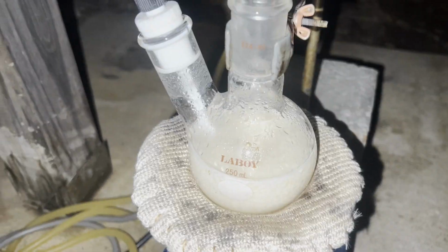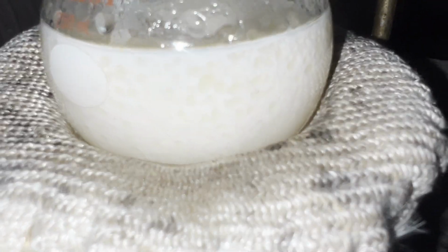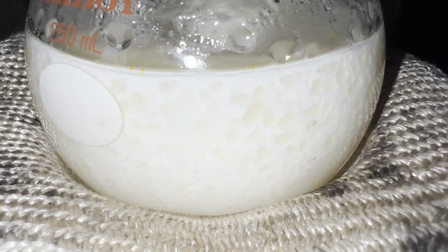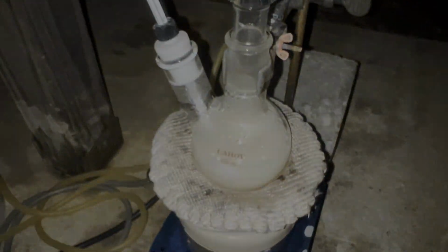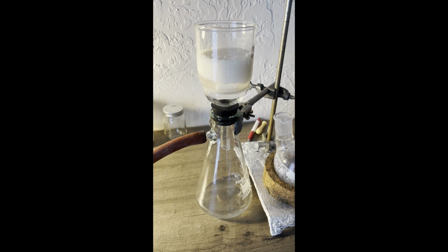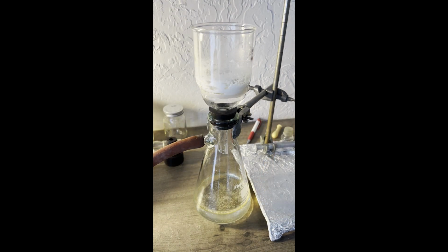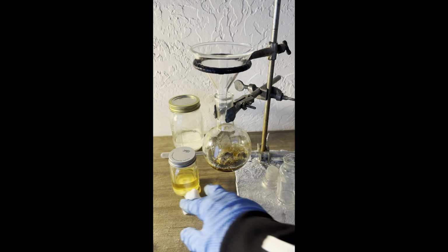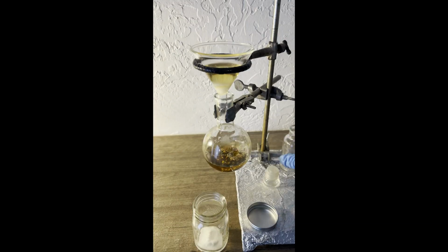The temperature was kept from 65 to 80 degrees, which is a little annoying to do. It's a lot easier to reflux something or stir something at room temperature, but warming it at a specific temperature between ambient temperature and reflux and holding it there for 5 hours is kind of annoying. It's especially annoying when it's done with just a heating mantle, not an oil bath or a water bath. It did take some babysitting, but it eventually worked out.